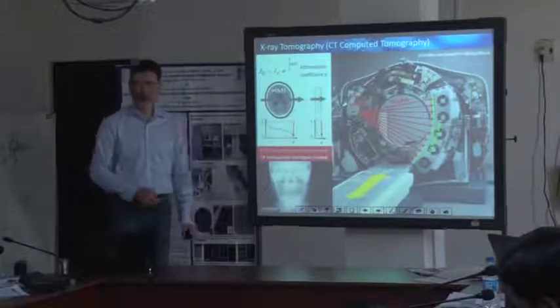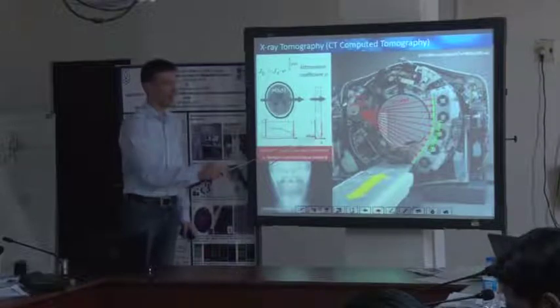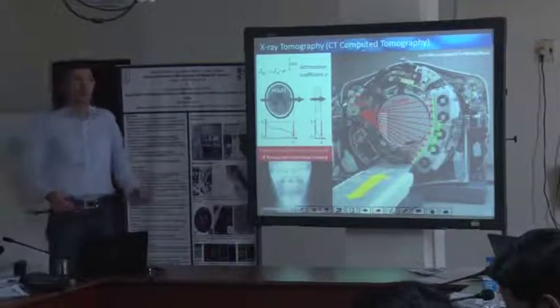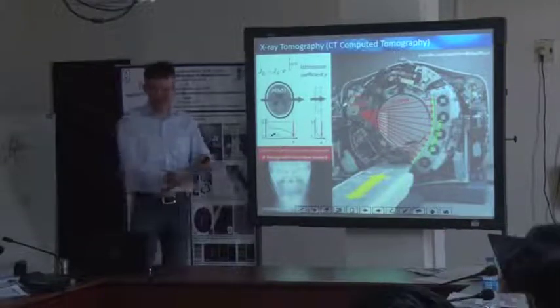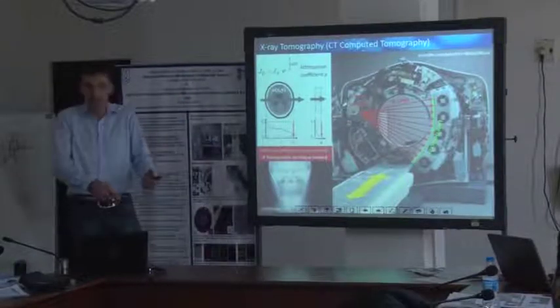It could be different samples positioned in between that cause the same final measured intensity on the detector. The same holds for mass thickness contrast in TEM or in STEM imaging. It could be either a thick sample that causes some contrast in dark field STEM imaging, or it could be just some heavier sample.